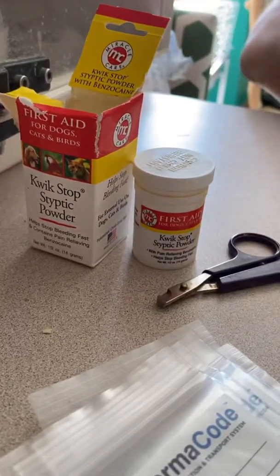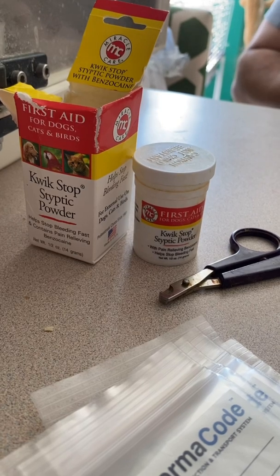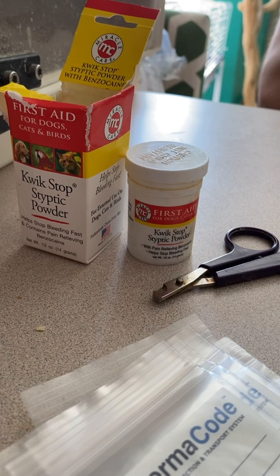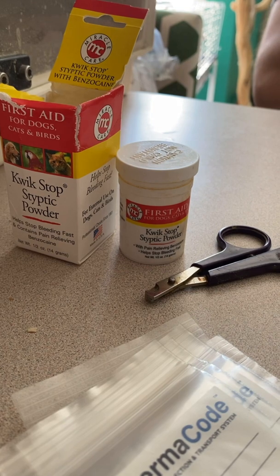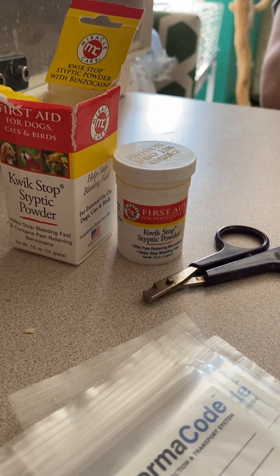These are a few things that you're going to need. You're going to need Kwik Stop styptic powder. You don't necessarily need the brand Kwik Stop — you just need styptic powder to stop the bleeding once you cut the nail. You'll also need a pair of nail trimmers and the DNA cards that you see right there in the corner.